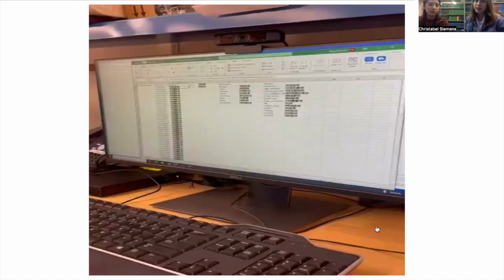This is our Excel sheet that generates our barcodes. And you may or may not be able to read it, but you're going to see all the barcodes for the employees and the different stations that they scan samples in and out of are on the right side in those short lists. And then that big long list on the other side is all of the soil IDs that have been generated so far. So here we're selecting all of the IDs that we would like to print.